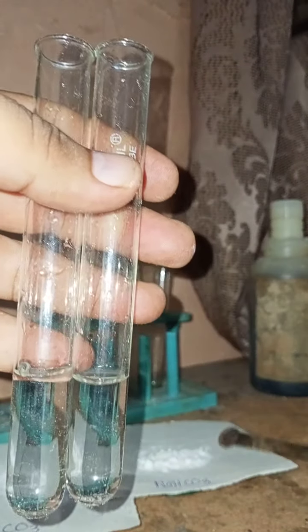Now I am going to add a spatula full of both the substances into the test tubes respectively. So you can see that I have added the substances. Now you can see I am going to mix them.